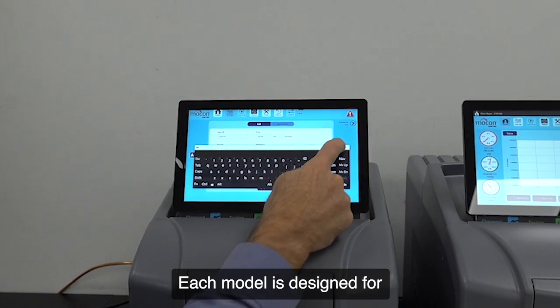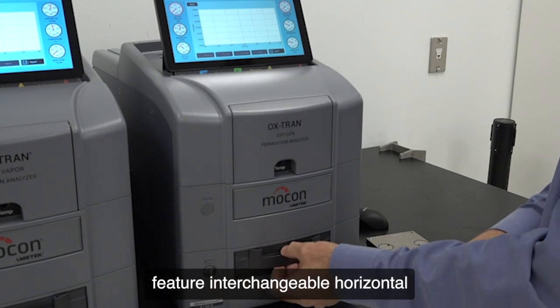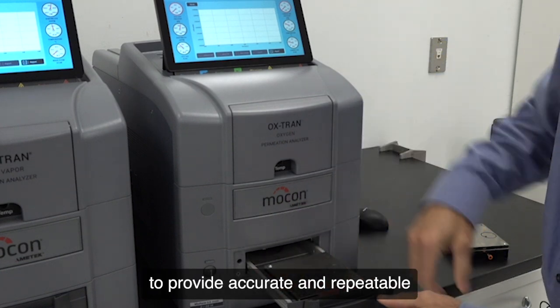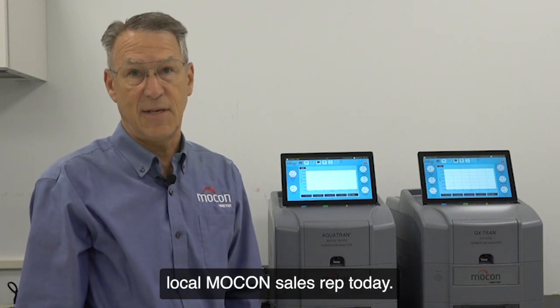Each model is designed for high performance film testing and is capable of full package testing as well. These single-cell instruments feature interchangeable horizontal test cartridges that can analyze various sample sizes and types to provide accurate and repeatable test results for a wide detection range. To learn more, contact your local MoCon sales rep today.